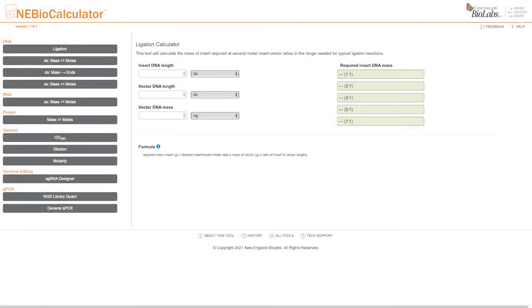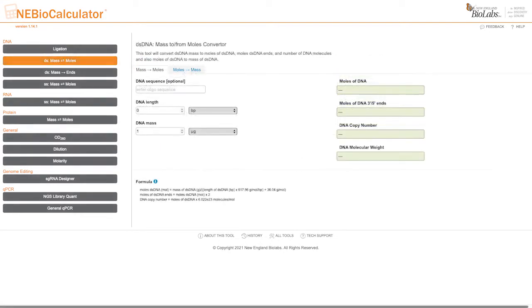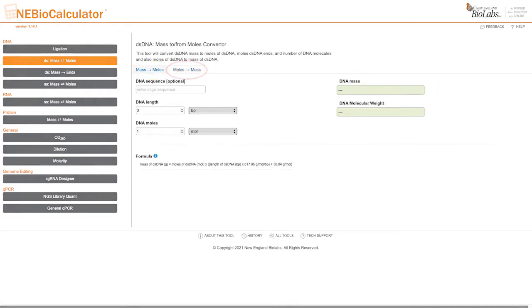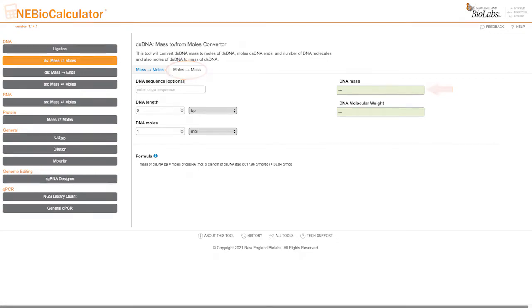The double-stranded DNA mass to from moles converter module has two modes. The mass to moles mode converts the double-stranded DNA mass to moles of double-stranded DNA, moles of double-stranded DNA ends, and the number of DNA molecules. The moles to mass mode converts moles of double-stranded DNA to the DNA mass. This can be useful for setting up an NEBuilder HiFi DNA assembly reaction.